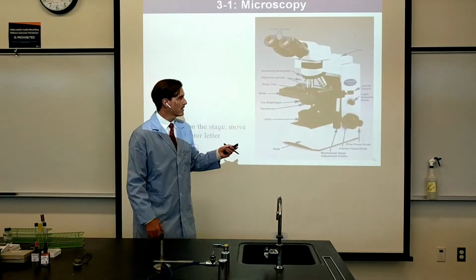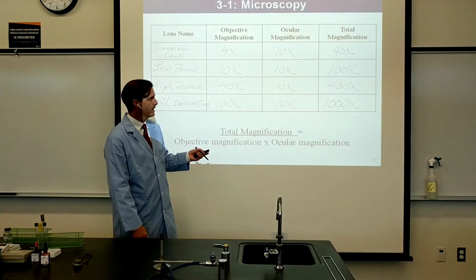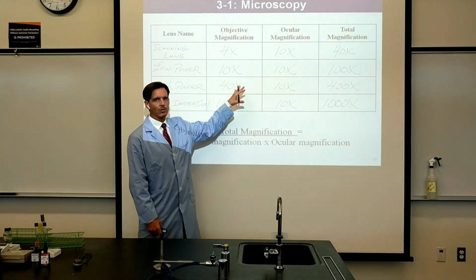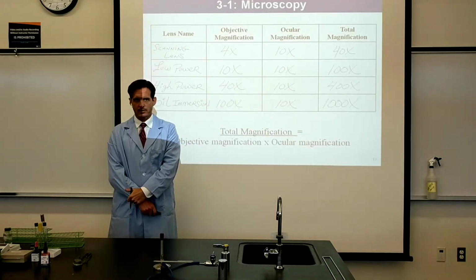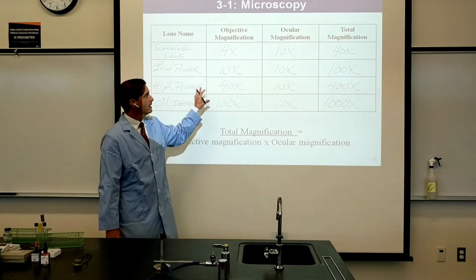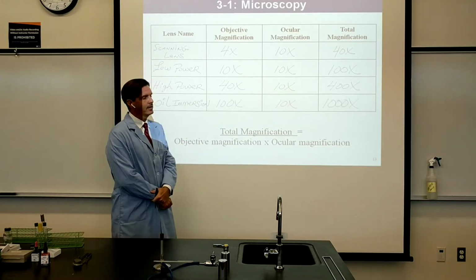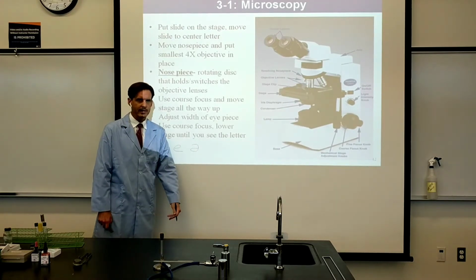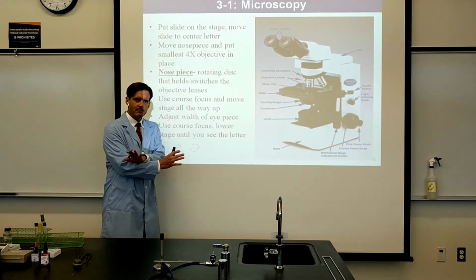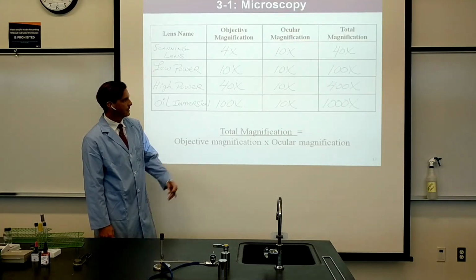We were looking at microscopy last time, and one thing I wanted to point out, hopefully the white balance on the camera today will be able to show this particular slide better. So if you didn't get a good look at that last video, when I recorded this and wrote these in, I'm hoping that it's showing up better on camera now. Just like the previous slide, when I was talking about the letter E being flipped in mirror image reversed. So hopefully you got a chance to see that, or you're getting a chance to see that better now.